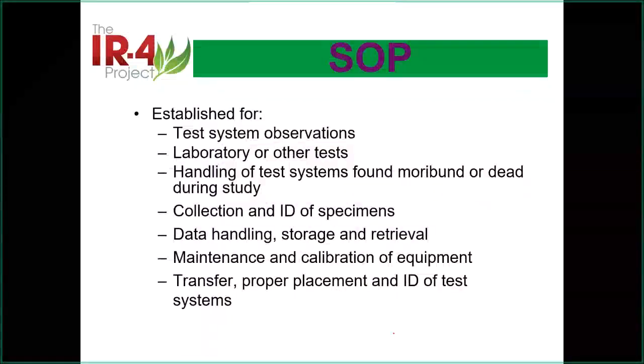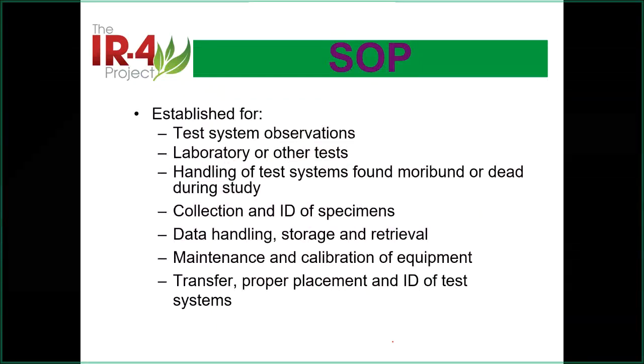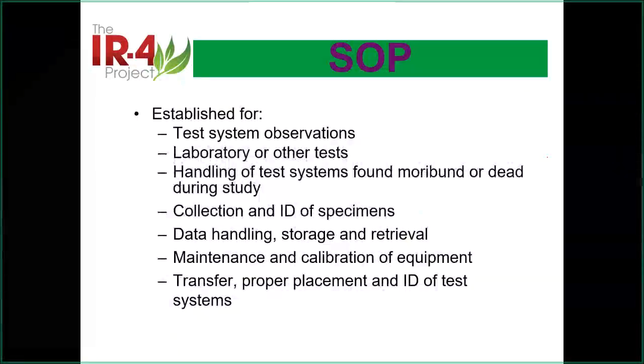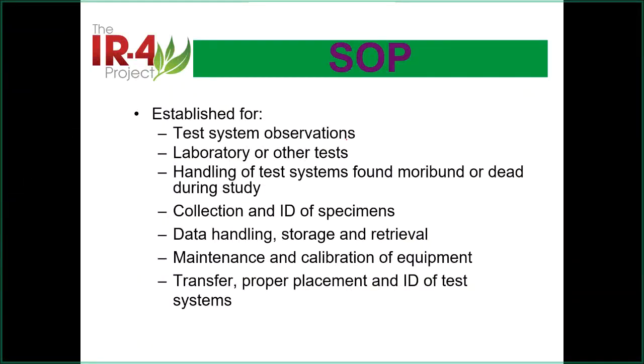This is an extension from the protocol. Okay, so in the test system, there will be a lot of things you need to put in the SOP. For example, how you record your observations.